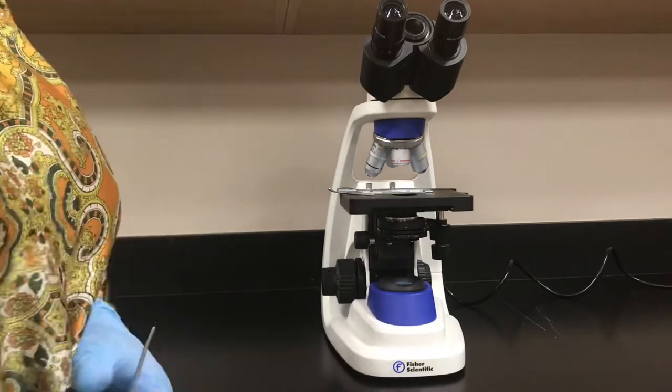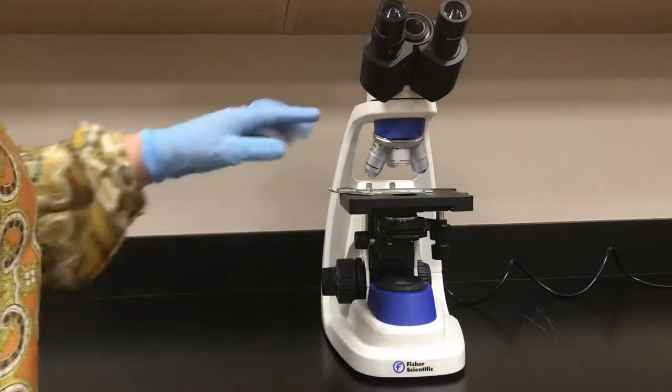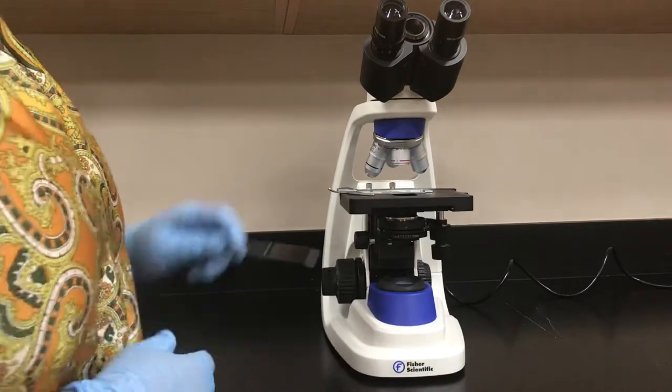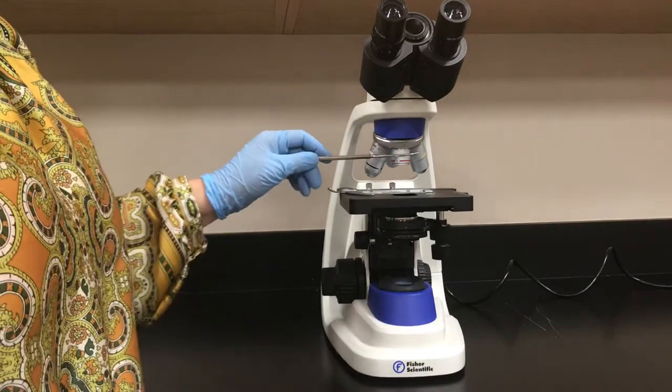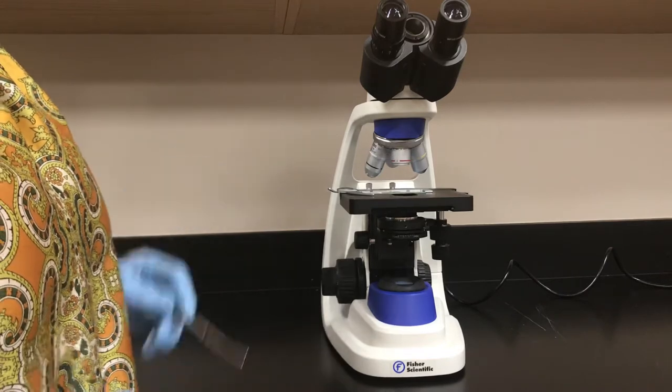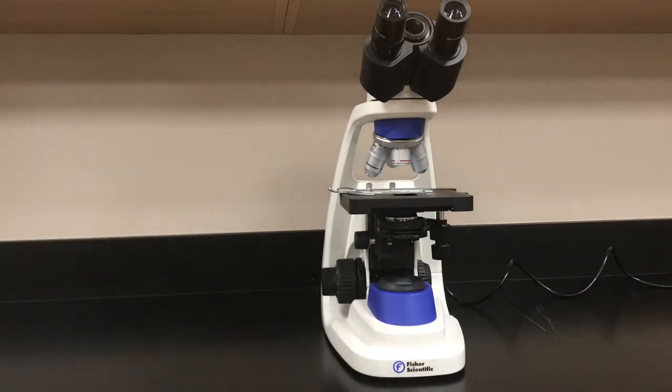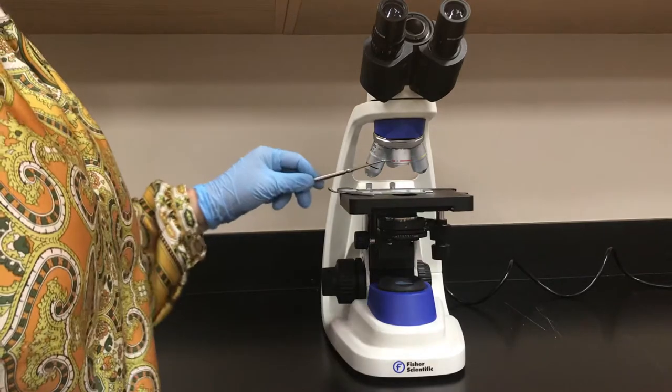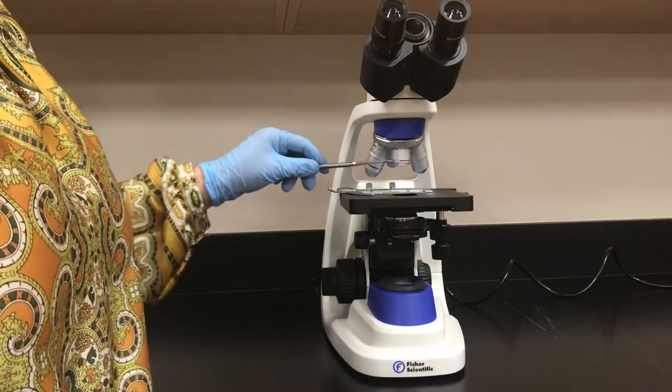The second group of lenses, as you see here, we call objectives. They have different color coding because they have different magnification powers. When the magnification power gets stronger, the length of the objective will be longer.